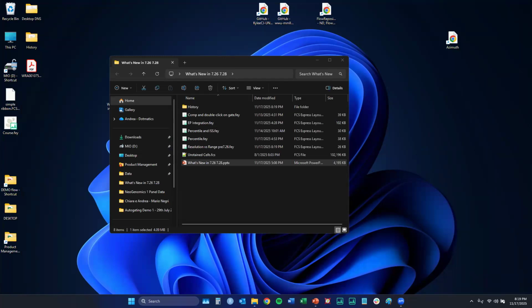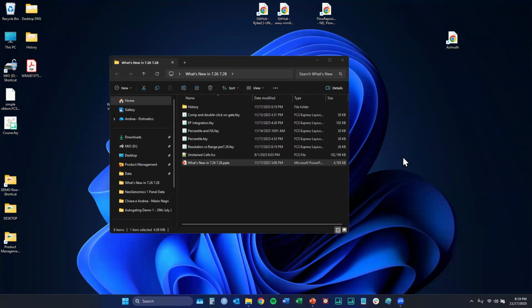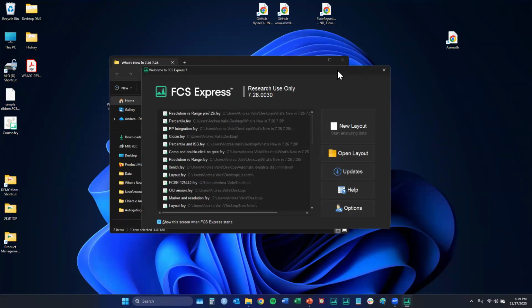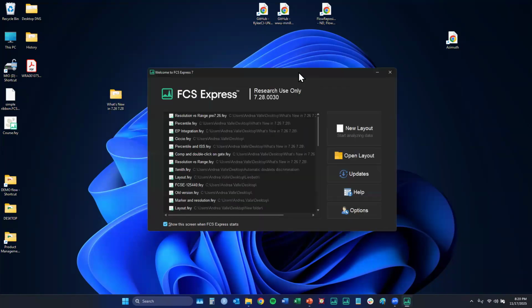It's on my screen. Okay. So you see I'm using dark mode. This is the startup script using dark mode, exactly as I showed you in my slide. First of all, this is the latest layout that I opened, the one that I just used in the previous version of FCS Express, the old one.